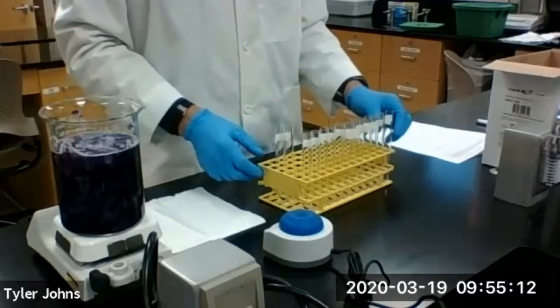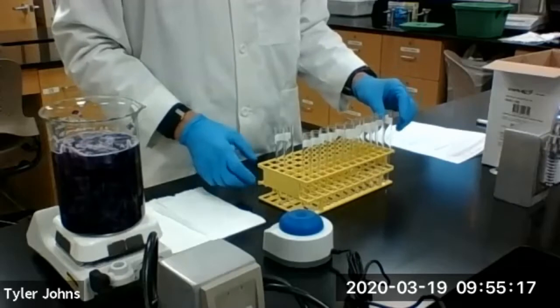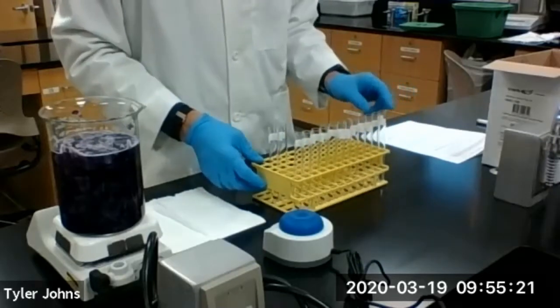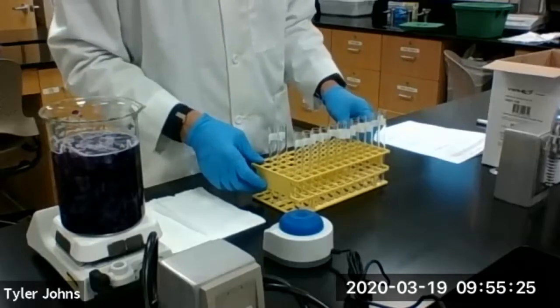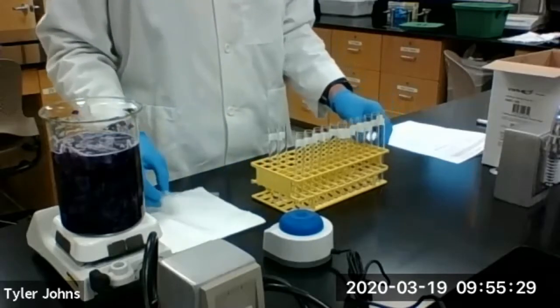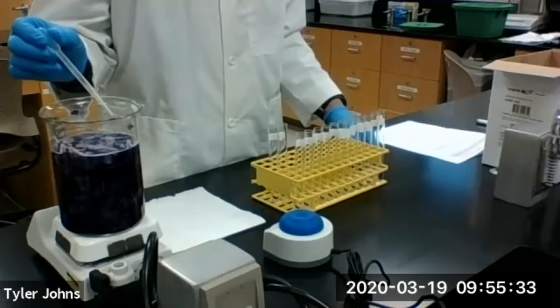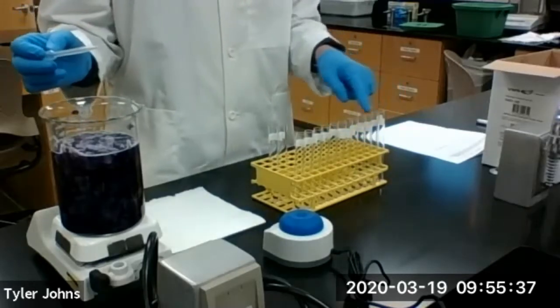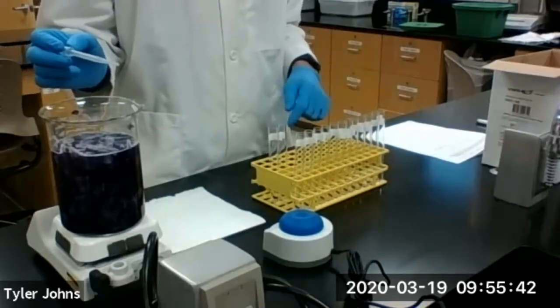I've also gone ahead and aliquoted different pH solutions into several test tubes numbering pH 1 through 14. We will not be doing pH 0 in this lab today. So we're going to go ahead and add about 40 drops of our cabbage indicator, or approximately 2 milliliters, to each of our pH test tubes, and we'll be checking to see what color the solutions become.